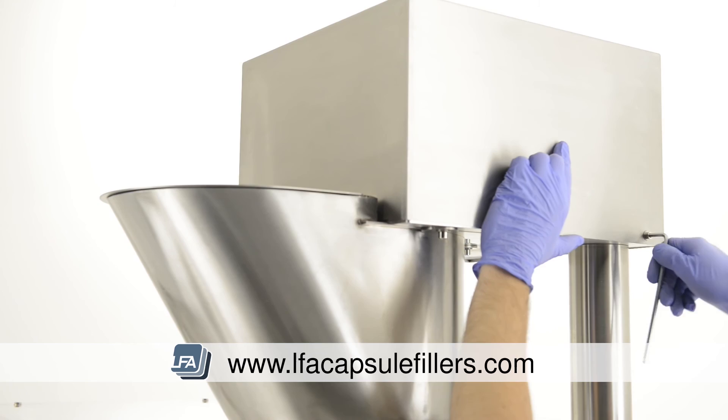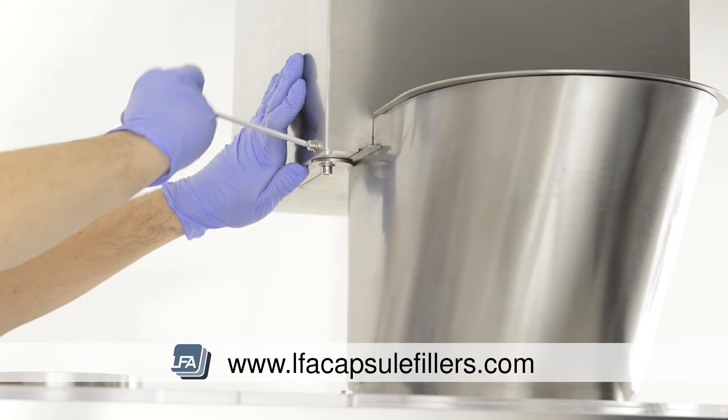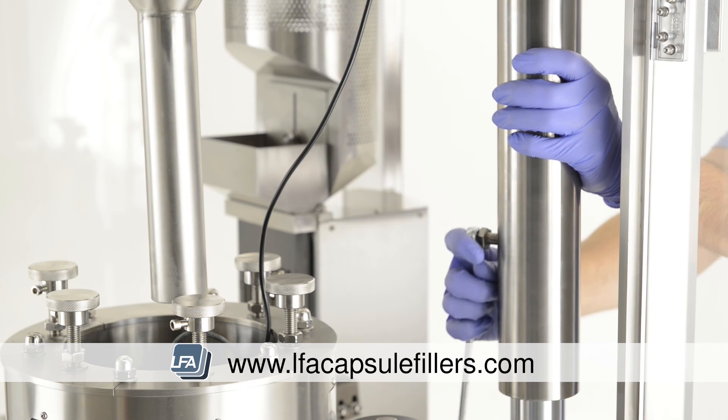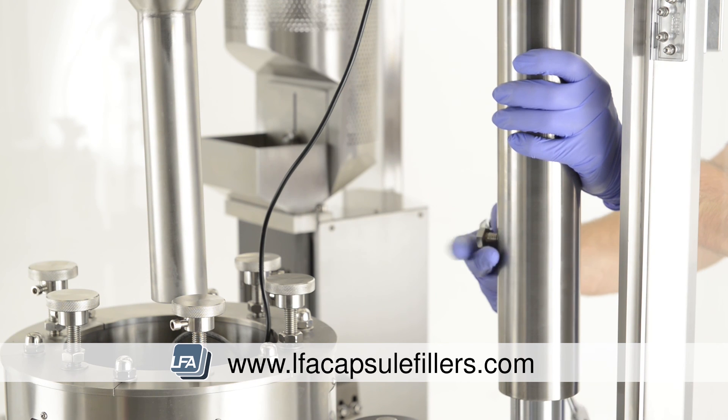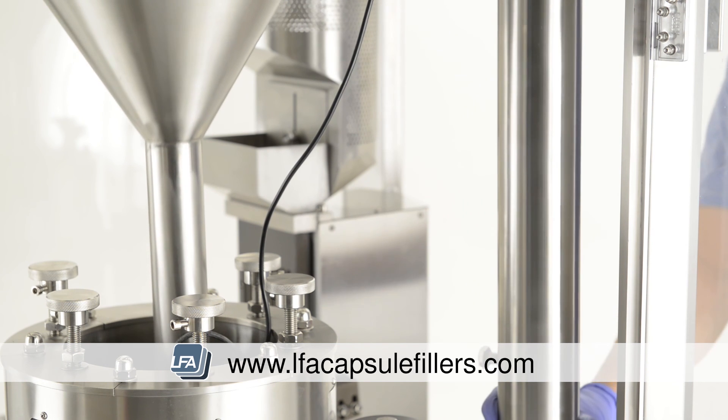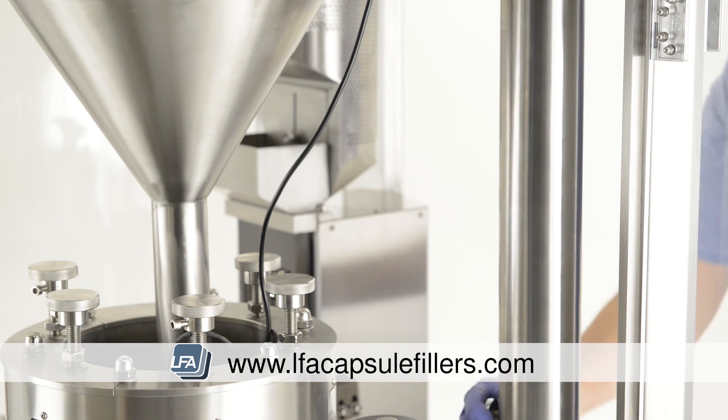Replace the cover of the auger filler motor and replace the bolts at either side. Now we lower the auger filler motor and hopper back down into position. Partially undo the bolt on the auger filler pillar and gently lower, supporting the weight. Once in position, re-tighten the bolt.